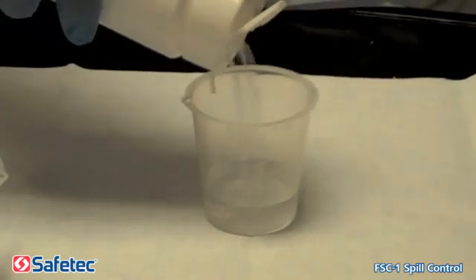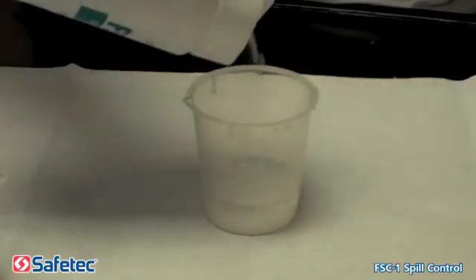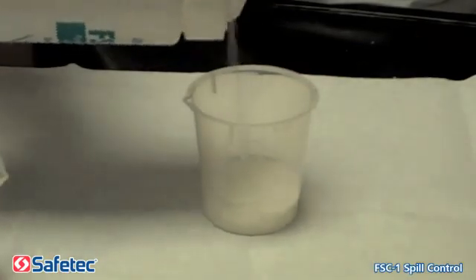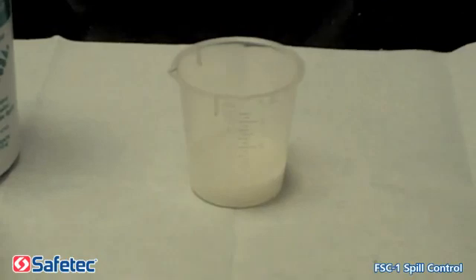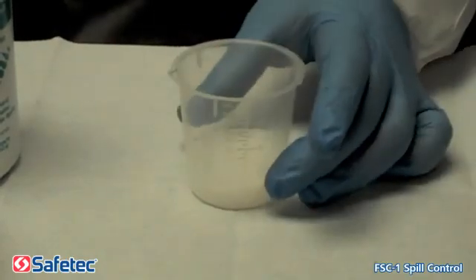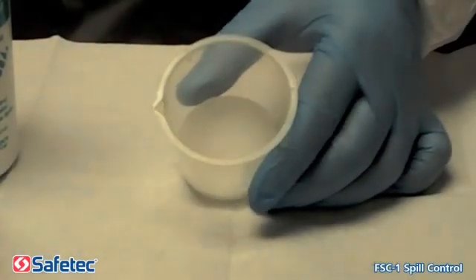Step 3: You will notice the fluid will quickly set. Please note, add more FSC-1 as you feel necessary. Finally, you are now ready for cleanup. Remember to follow your facility removal and disposal guidelines.